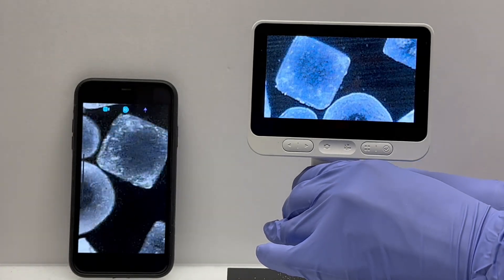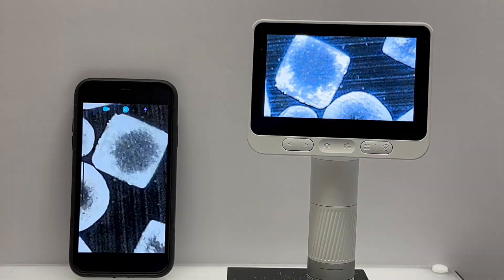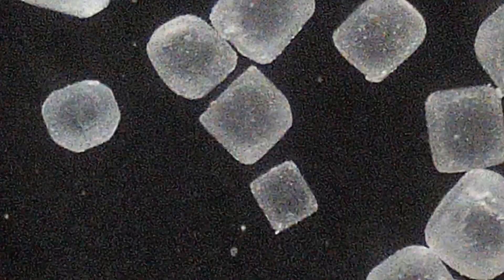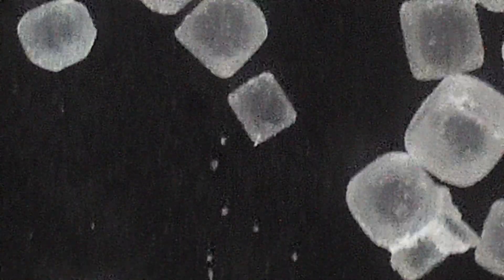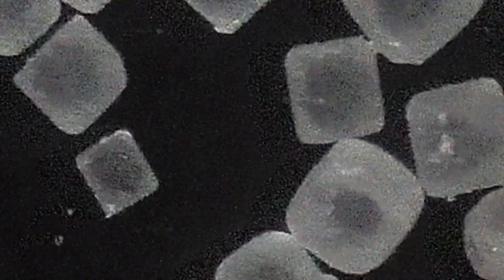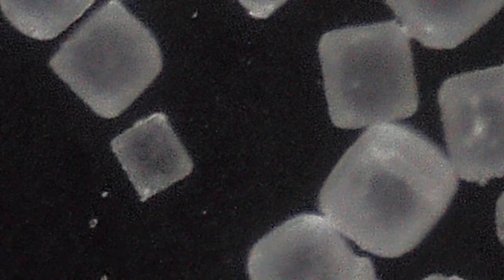Isn't that cool? You can see that crystals of sodium chloride have a cubic structure. A really cool feature is you can download the images onto your phone so you can look at them later.